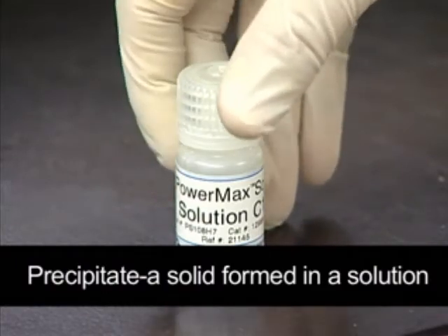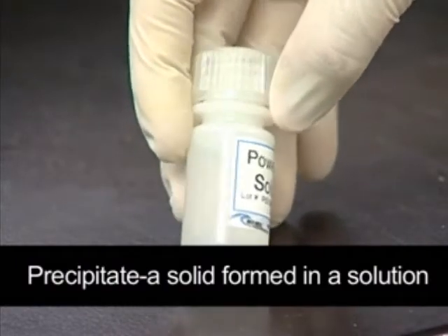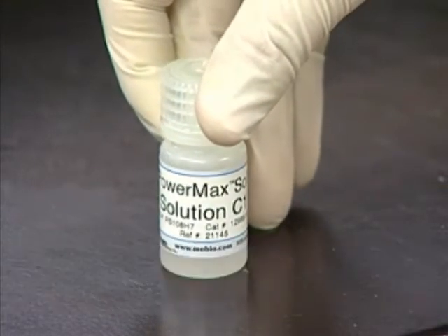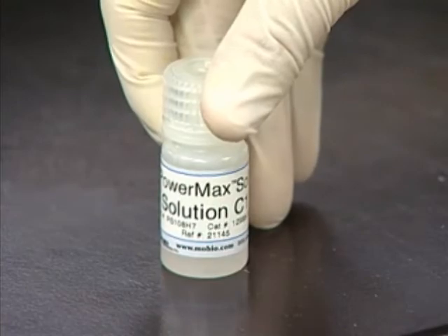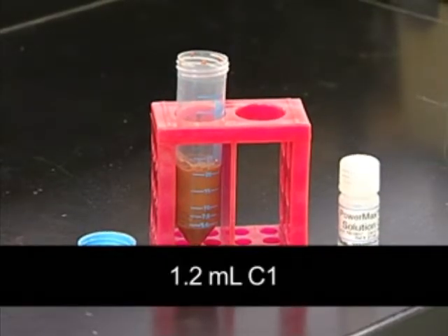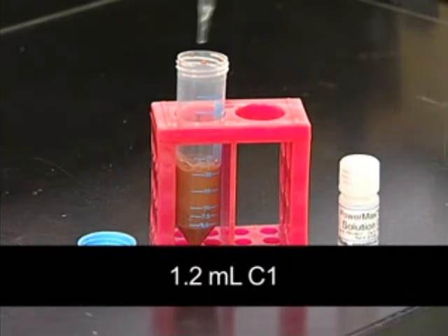Next, you want to take solution C1 and check for precipitation. This is rare, but if any precipitate is seen, heating the solution will re-dissolve the precipitate. If solution C1 looks good, take 1.2 milliliters and add this to the bead tube with the soil.